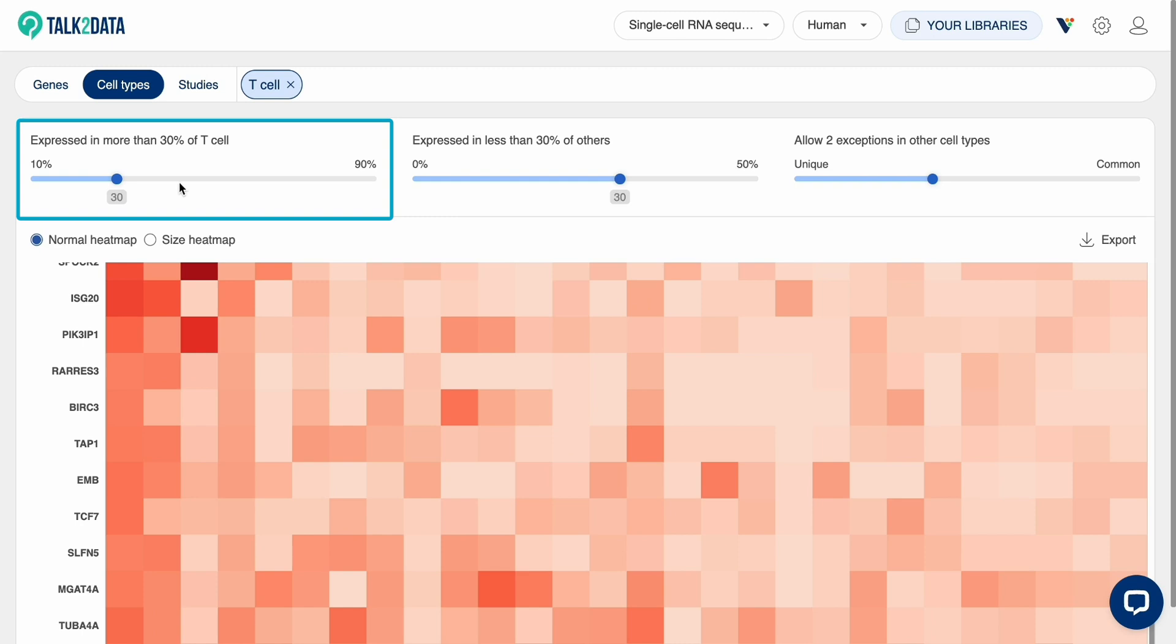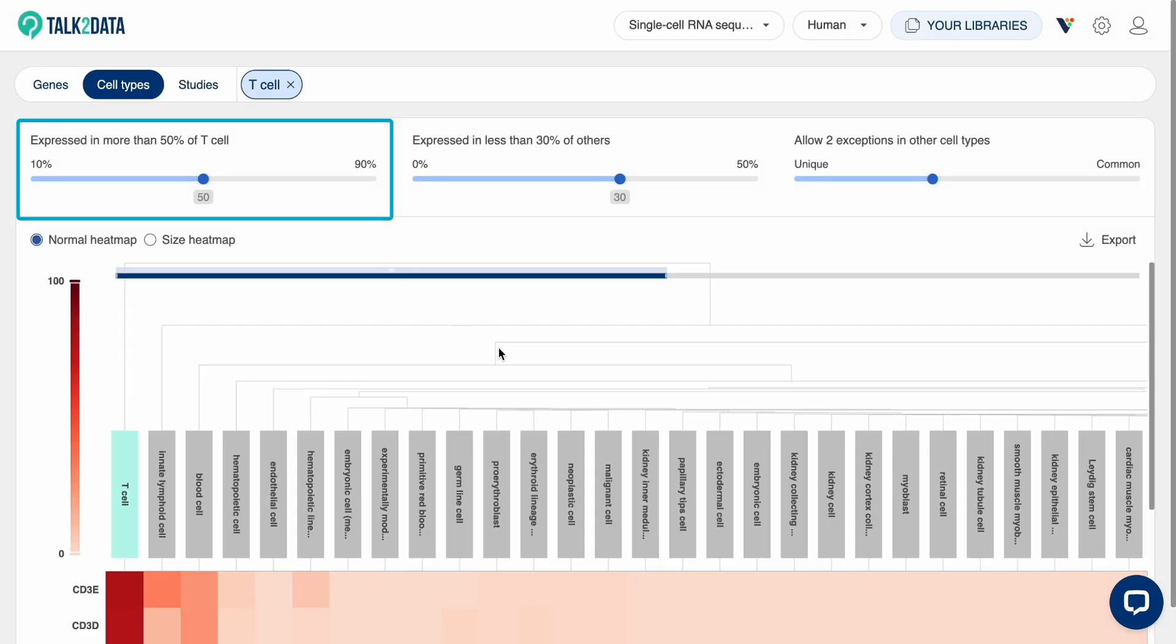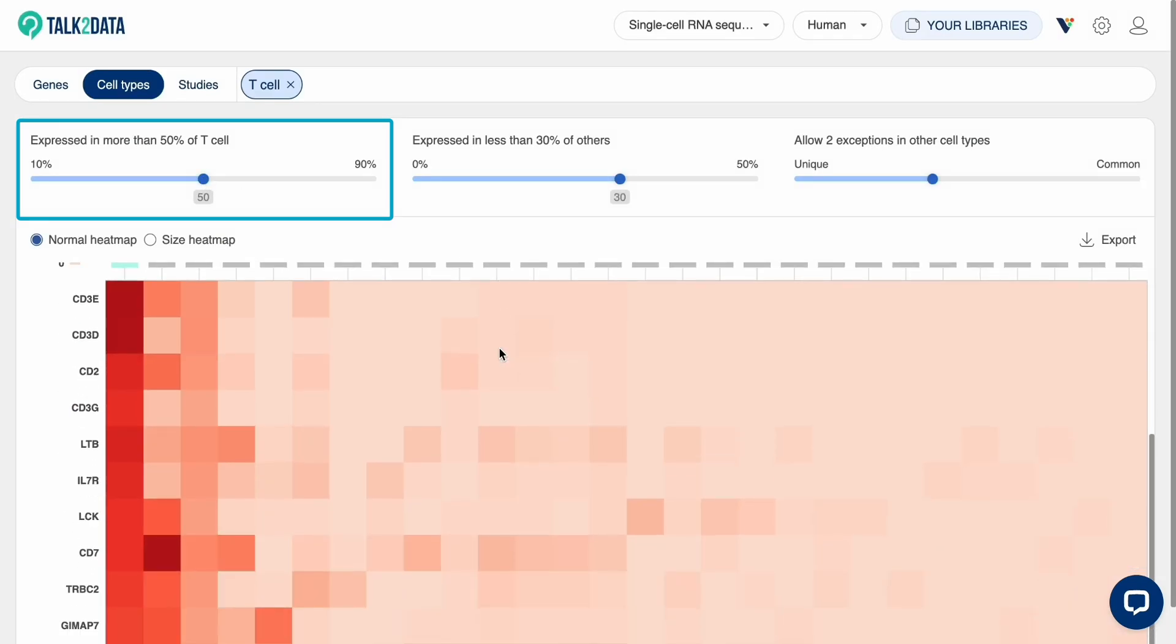The first parameter is used to set the required percentage of cells expressing the gene for the gene to be considered a marker. Genes that are expressed in more than that percentage of T cells will be retained.